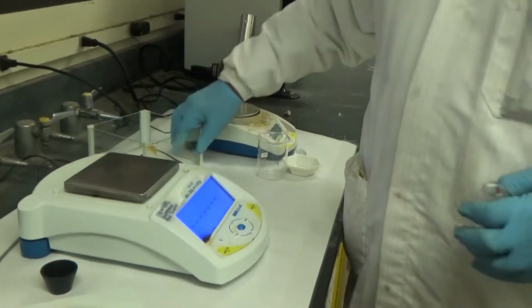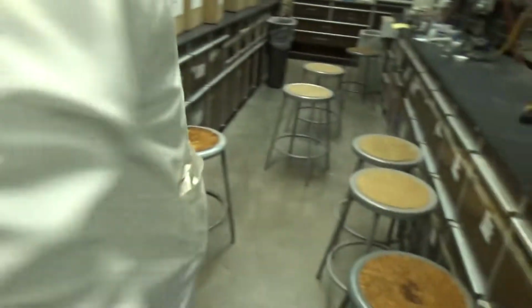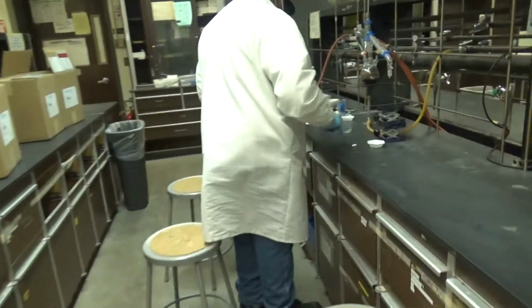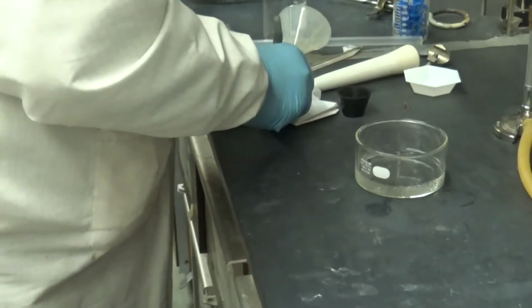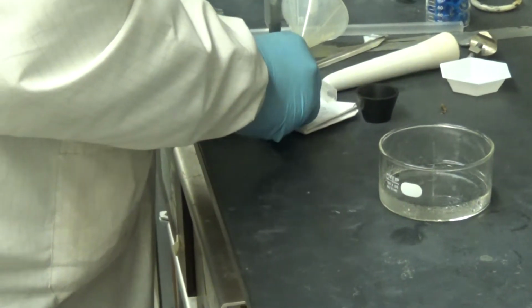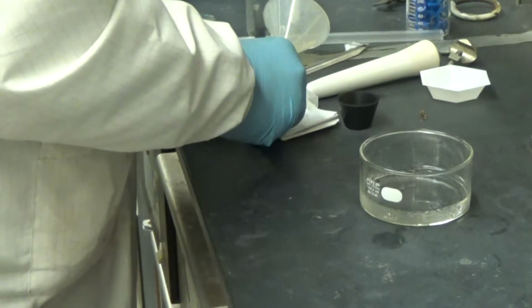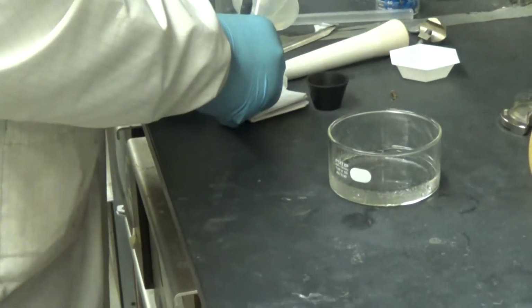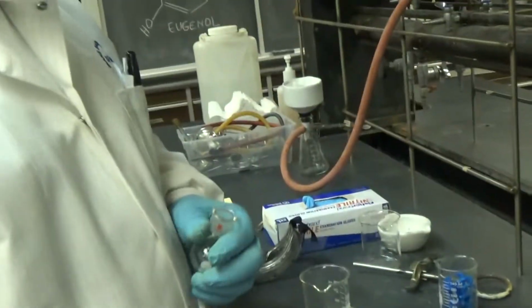Bring that back to 0. You need to put that back. You need to close it. Cool. 42.808. Let me correct. That means 42.808 minus 42.590. So 0.2. Your final number, you do that math, is 0.208 or 208 milligrams, or 0.2 grams. That's the final product, so that's the yield, I guess.